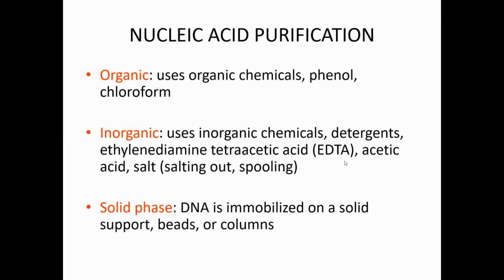Okay, and then of course the first method is the organic method. The organic method uses organic chemicals, including phenol-chloroform, to purify the DNA. Or you can use the inorganic method, with detergent, EDTA, acetic acid, and salt.